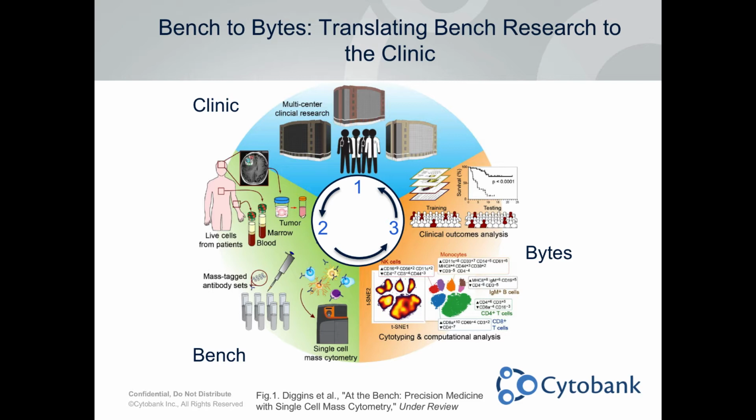The next phase in the cycle, where I'll talk about how Cytobank can help, is the bytes, the data analysis portion of the research cycle. The idea is that you will use computational tools or various machine learning algorithms here to help you identify cell populations, quantify signature features, and look for biomarkers in order to obtain reproducible results that you can then translate to the clinic and inform decision making there. That's why this is all very cyclical. You can take your data and start over again, move to the clinic, and potentially move through this cycle as necessary.